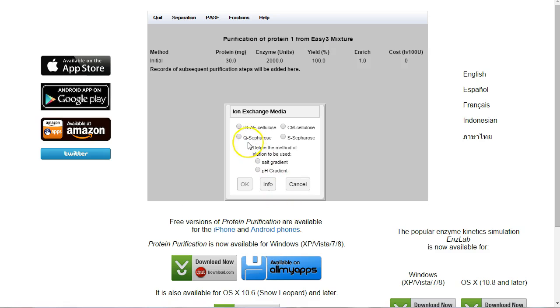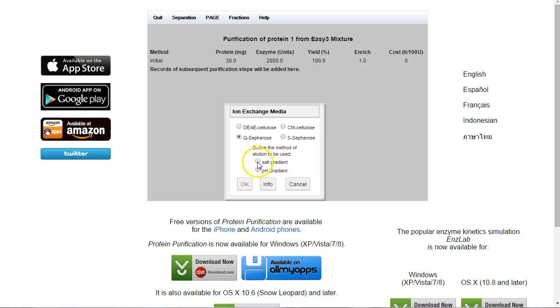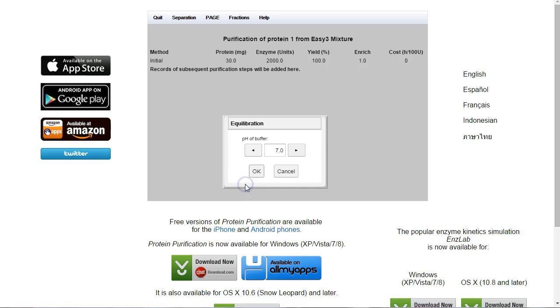I know that Q-Sepharose binds to negatively charged proteins. I know that we're going to use a salt gradient to elute it. The salt will displace the protein. It acts to counteract the charge of the protein itself. So we'll click on that. OK.